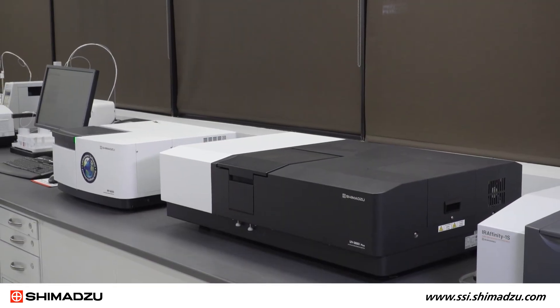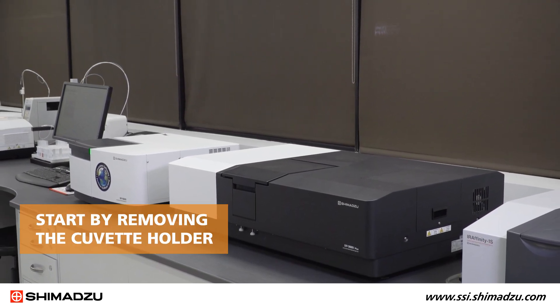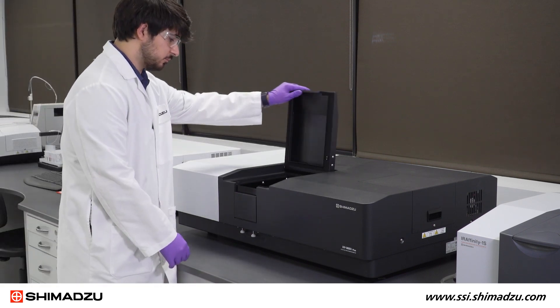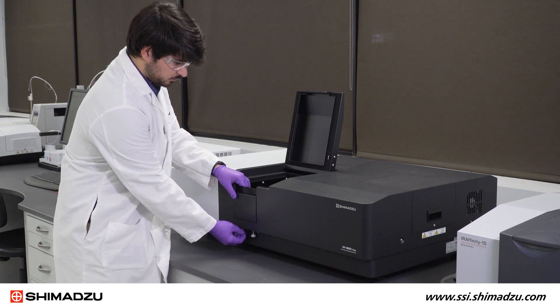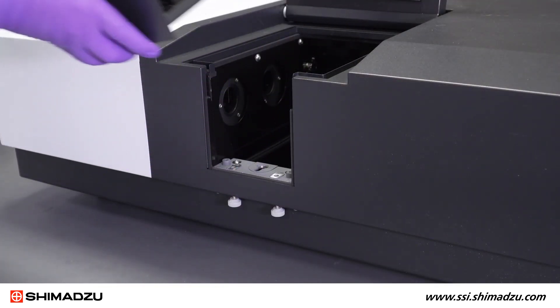To install the integrating sphere into your UV-Vis instrument, start by removing the cuvette holder from the spectrophotometer. Open the sample lid and unscrew the lock screws under the sample compartment. Once the screws are freed, lift the front of the sample compartment and pull it out.